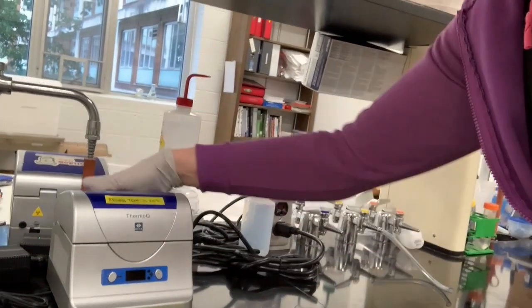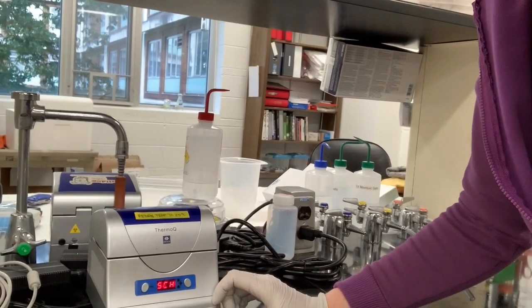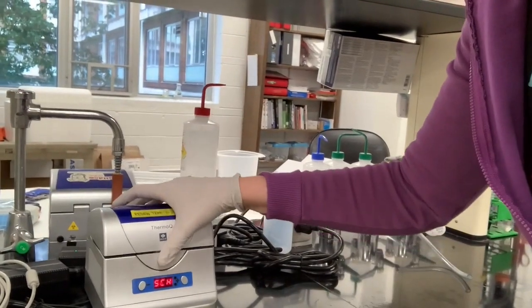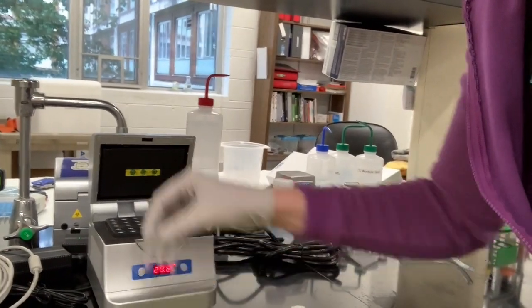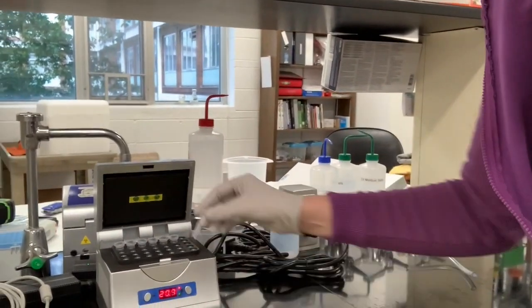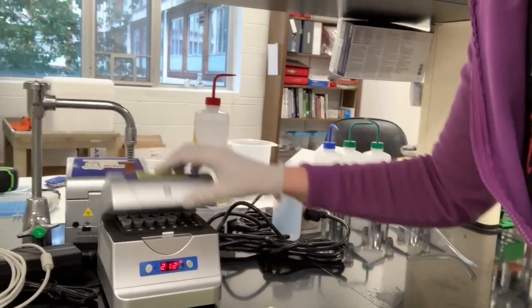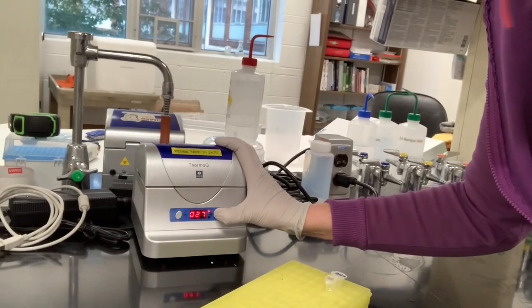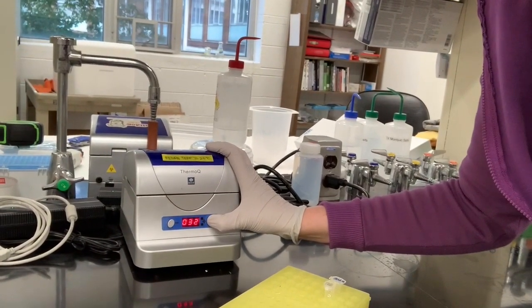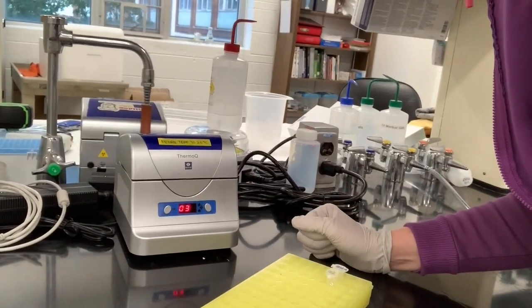So once you're finished with your reactions, you're going to go to one of these little machines that are around the lab. You may need to turn it on. You're going to set the temperature to 37 degrees once it's warmed up, and you're also going to put your samples into the machine. So here I'm putting the samples in. And then I'm going to check to make sure this is set at 37, because I'm going to do my reactions at 37 degrees overnight.